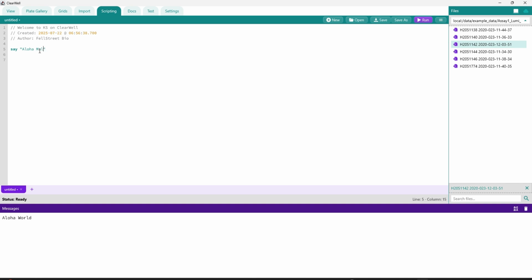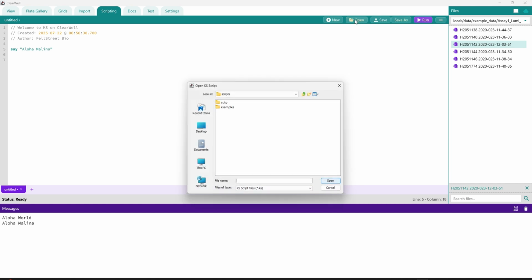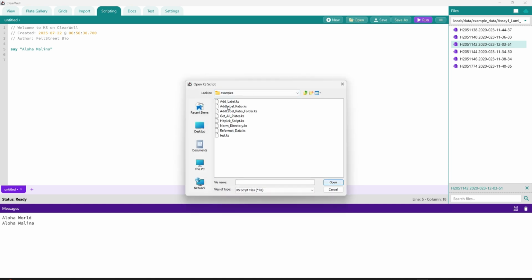Now, modify the script to greet yourself and run it again. Congratulations, you have successfully altered and run a script. Next, we'll be using a much more complicated script. However, you shouldn't have a problem.